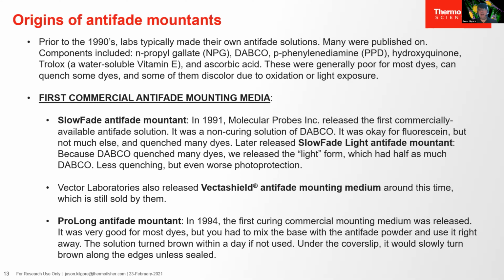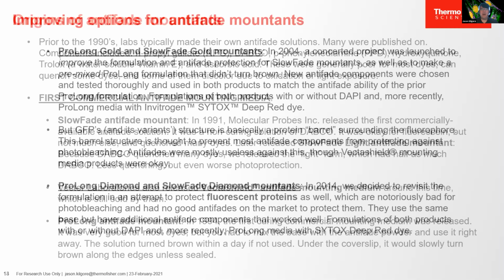And it had a proprietary antioxidant that you had to mix with the base, and it was difficult to mix up, and you had to use it right away or it would turn brown as a stock solution. But nonetheless, it was still really good for its time. And we just discontinued it a few years ago. It was still quite popular.